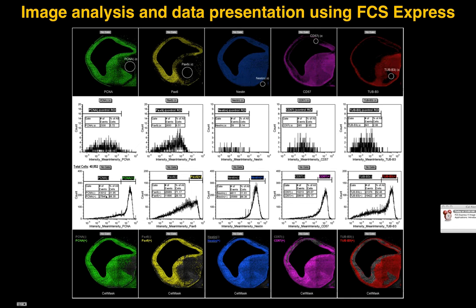And in this case, we can even have a quantitative number. In this case we have 40,000 cells in the total image, with 13,000 cells representing 32% of the total being PCNA negative, and the remaining population, in this case 27,840, which represents about 68% PCNA positive.